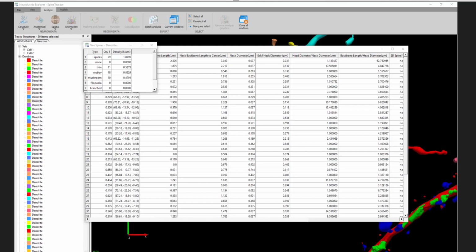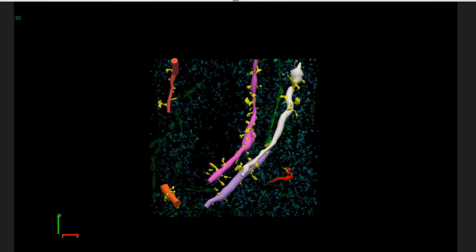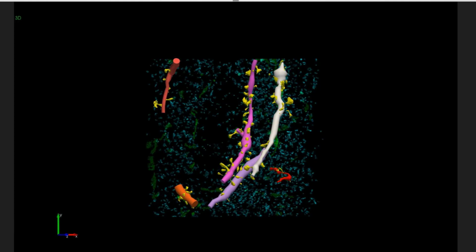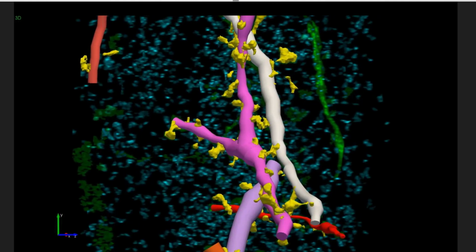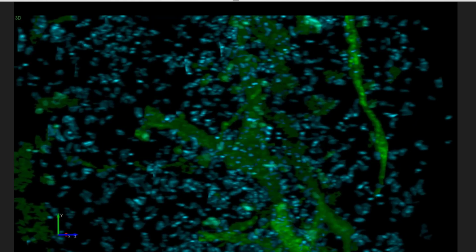We're running a little close on time, and I apologize for rambling, but there is one more thing that I want to show before I answer a couple of questions. And that is a data set that we were so excited to work with. This data set is an example of expansion microscopy that comes from a collaboration between Dr. Eric Betzig and Dr. Ed Boyden back in 2017.